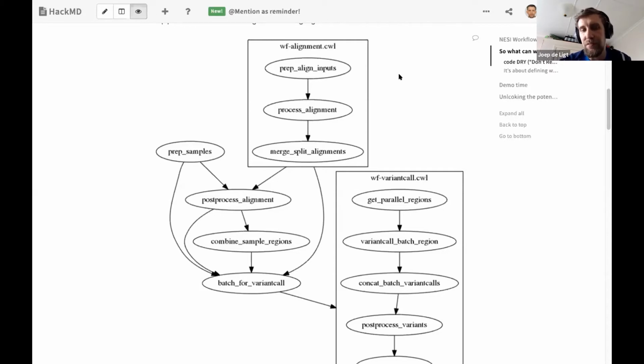With some of the processes that we use in genomics, there are, of course, random number generators or other less reproducible things involved. So it's about having a test set that reflects the biological signal that you want to get out at the end.